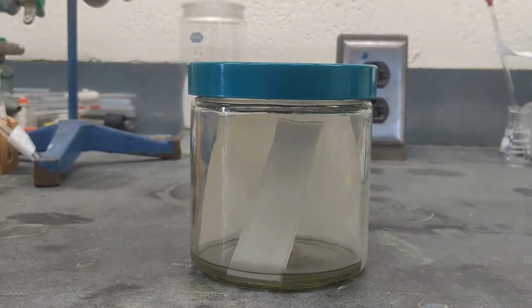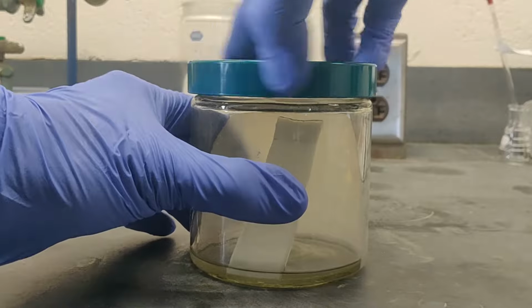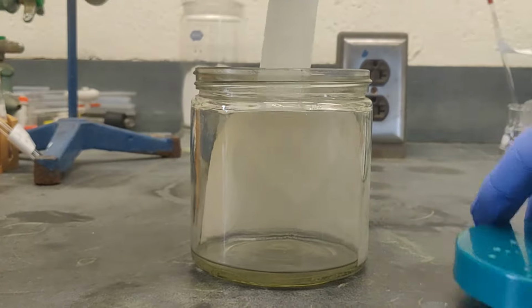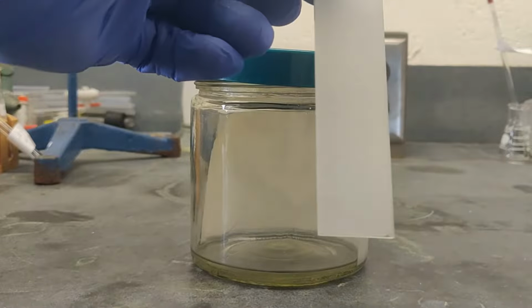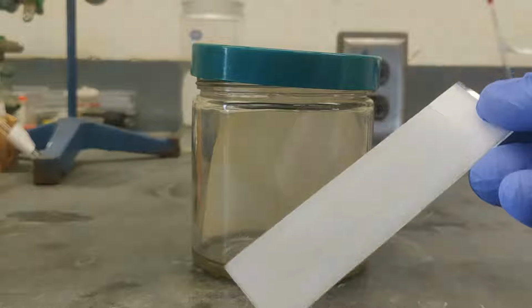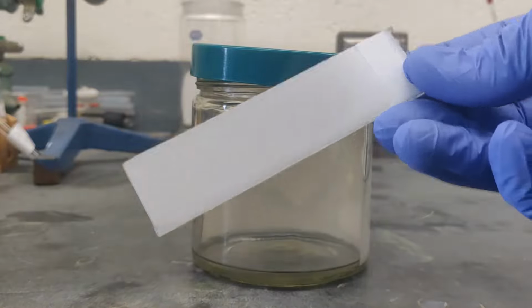When the eluent reaches the pencil line marking the solvent front, remove the plate from the chamber and replace the chamber lid. If needed, the eluent can be reused repeatedly, but at the end of the experiment, remember to discard it according to the instructions in the experimental procedure.